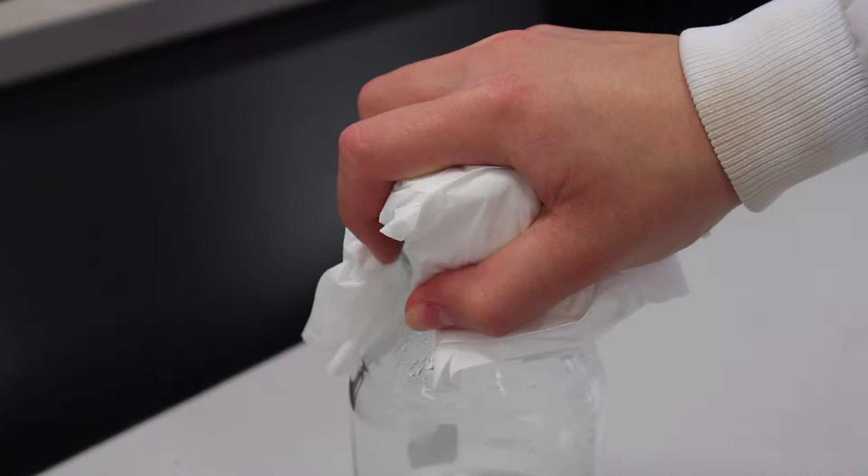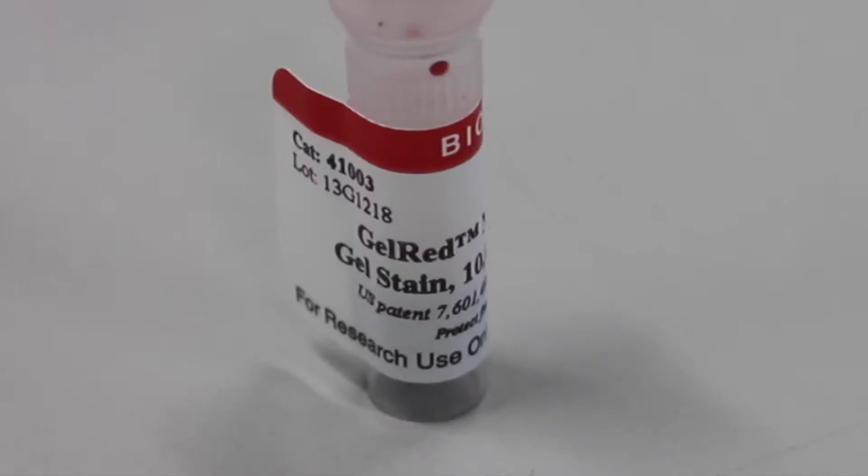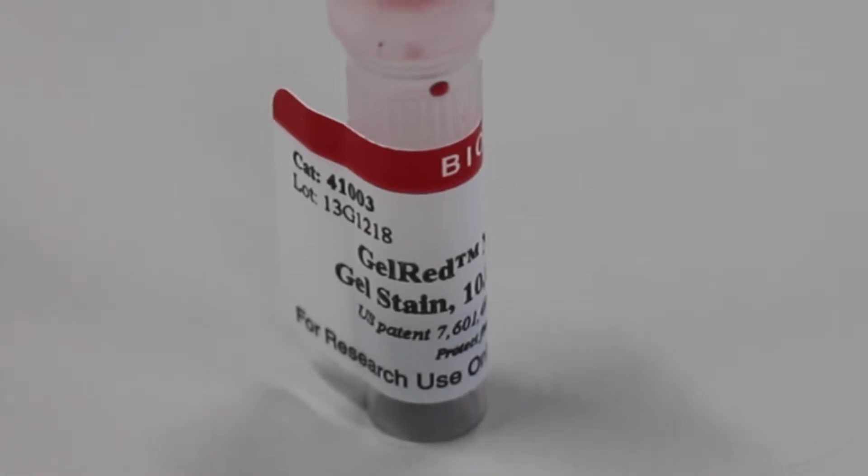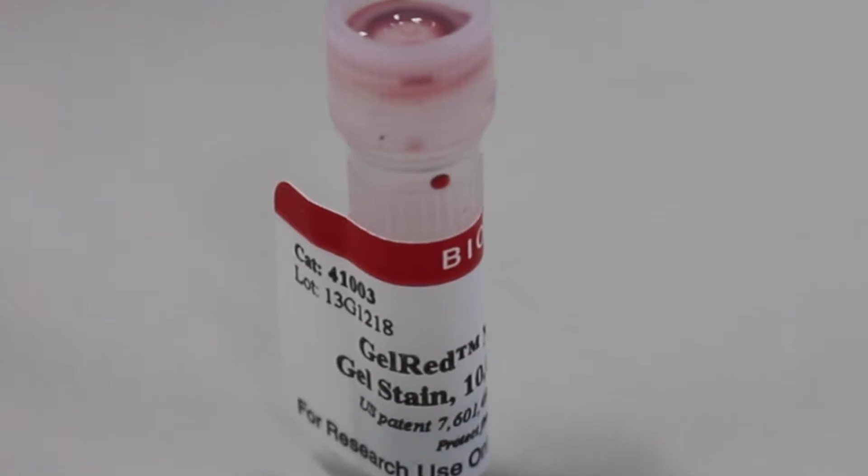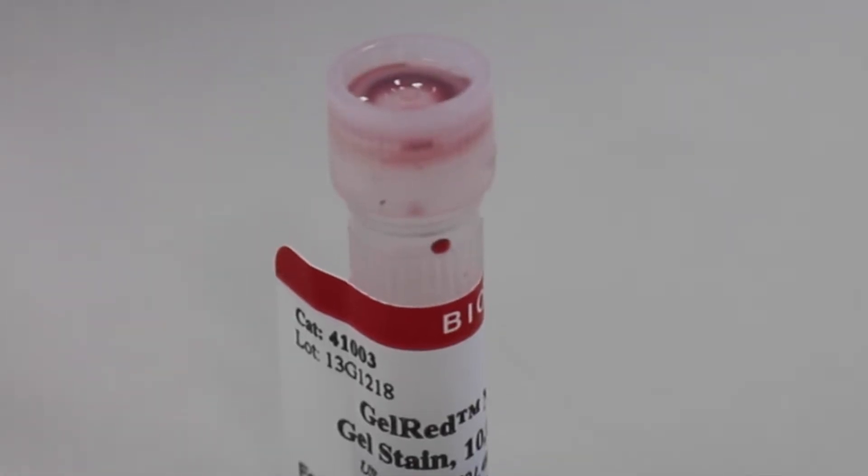The agarose solution is now allowed to cool down. Gel red, which is a DNA stain, is added once the solution is cool enough to touch. This step is important because this DNA stain allows the DNA to be visible under UV light later on.